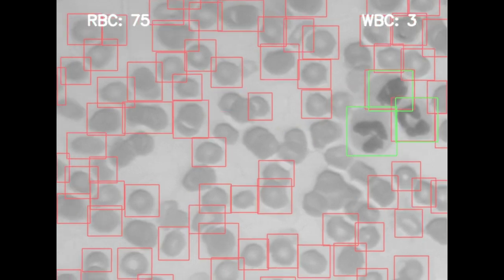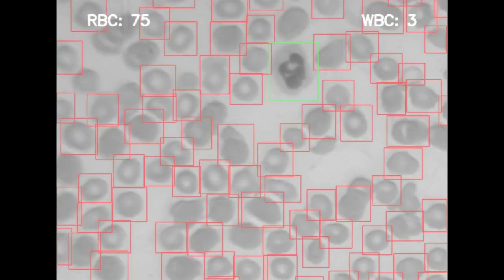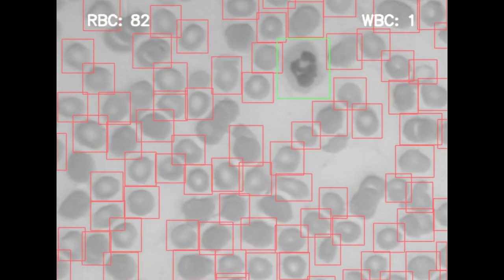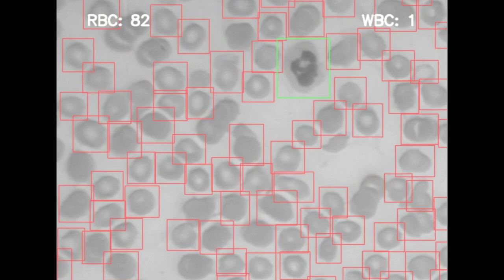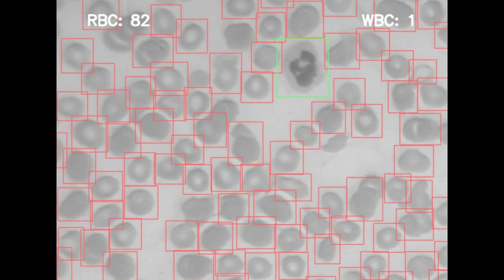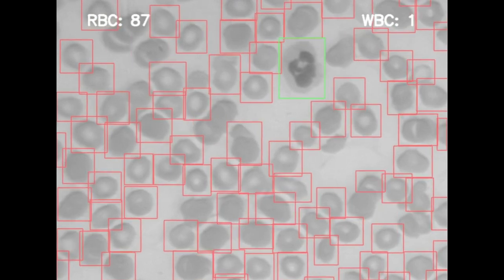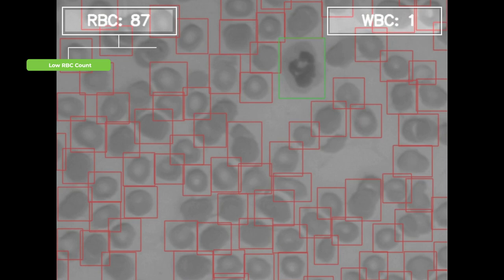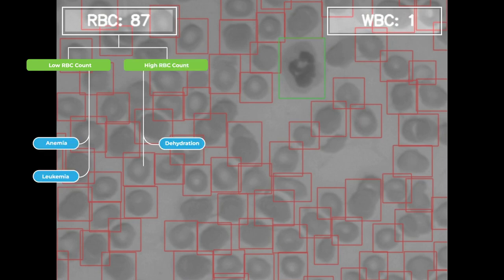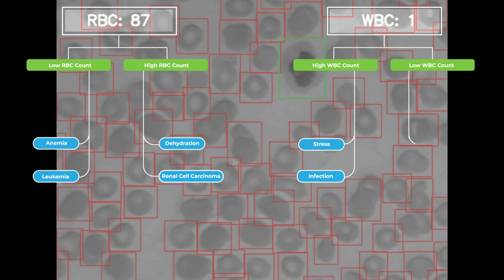An AI model counts the number of RBCs and WBCs from the specimen image. The complete blood count test helps to diagnose several medical conditions — for example, low RBC counts lead to a diagnosis of anemia.